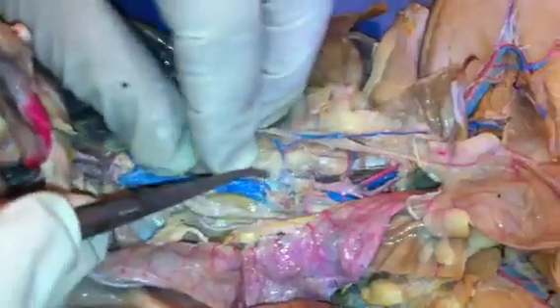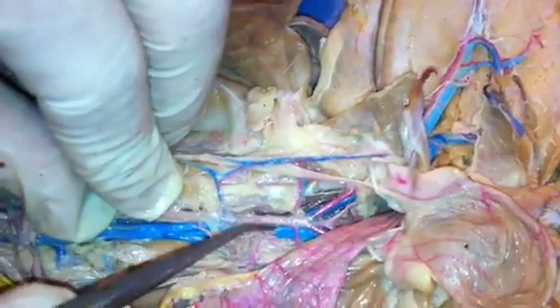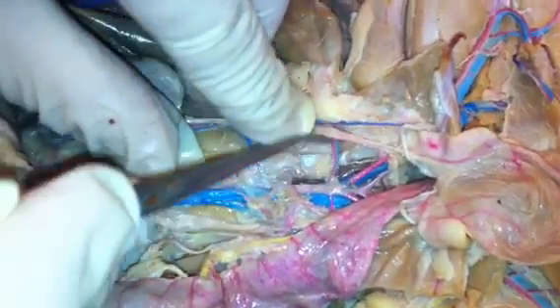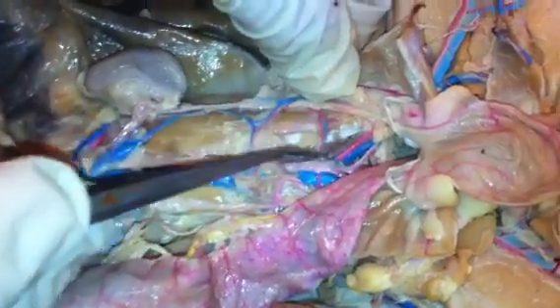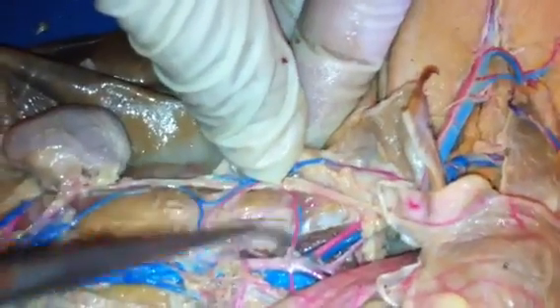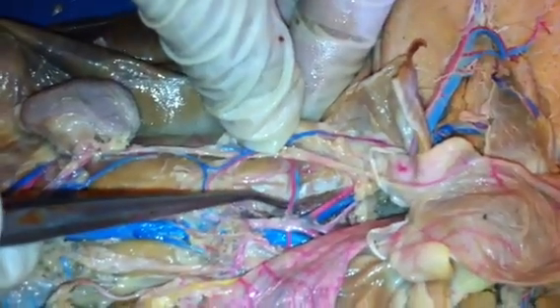Now, as we move further down from this, we come to a point where the inferior vena cava begins to dive deep. The abdominal aorta stays superficial here. And just before it branches, we see 2 blood vessels coming across the muscles in the back of the cat, and these are called the lumbars. In a human, there would be many of these regularly spaced. In the cat, we just typically see this one. So this is going to be a lumbar artery, and the blue one alongside it is the lumbar vein.